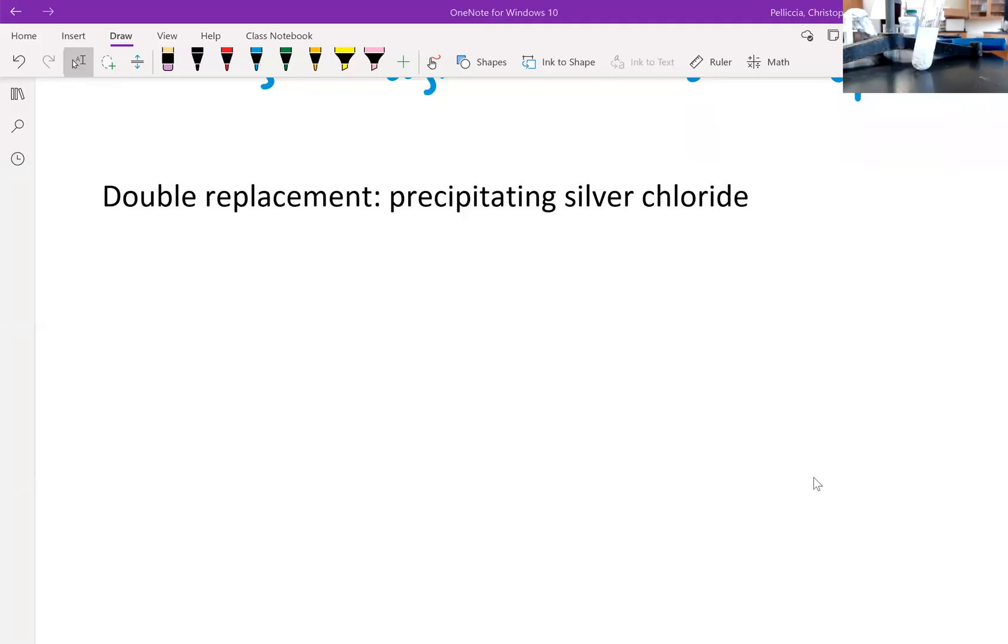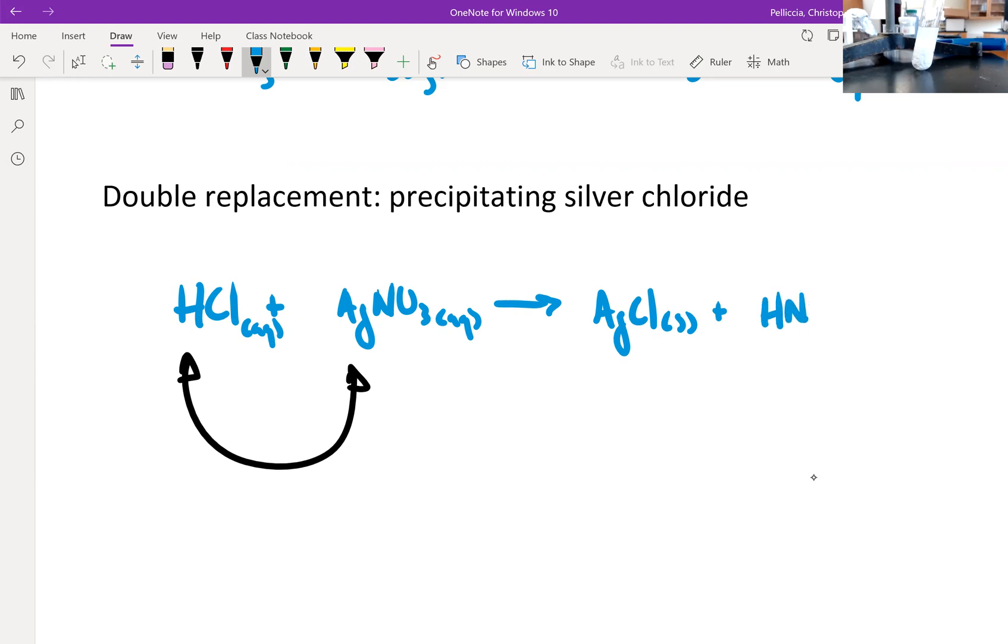So this final reaction again is a double replacement reaction. I took my two reactants, hydrochloric acid and silver nitrate, and carried out a double replacement where the hydrogen and the silver switched places. That generated for me products of silver chloride, which it turns out is the solid, and HNO3 or nitric acid.